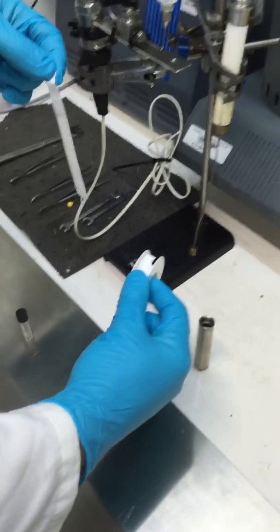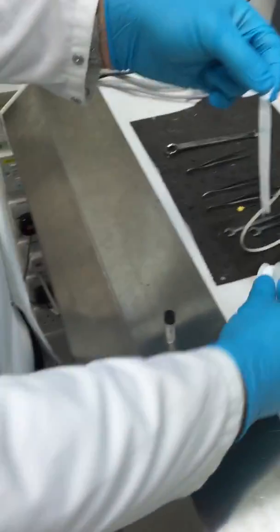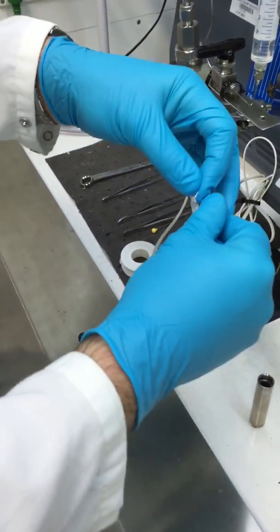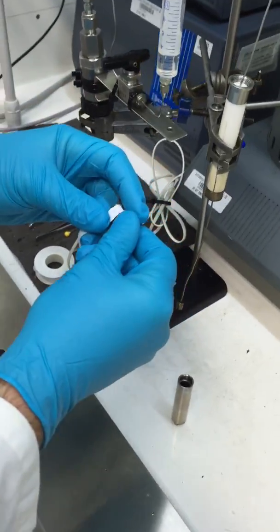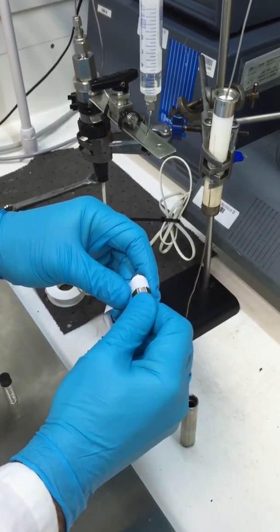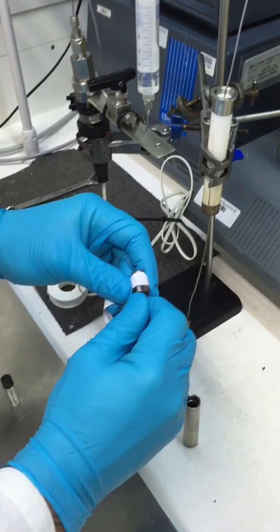It's a demonstration of how we set up a C80. We wrap the nut in Teflon tape, and this ensures a good seal so we don't get any leakage from the cell test while it's running.